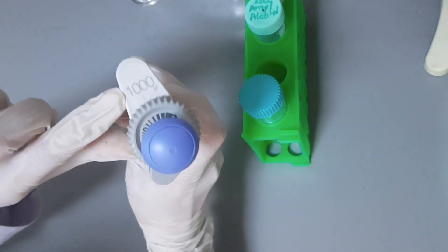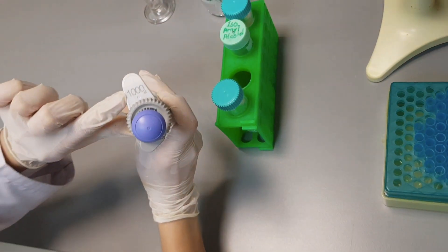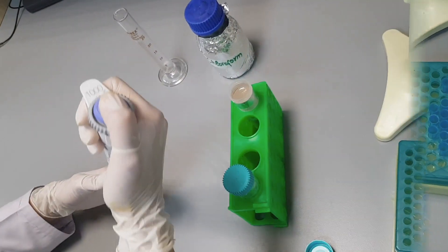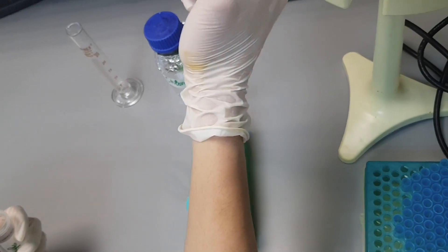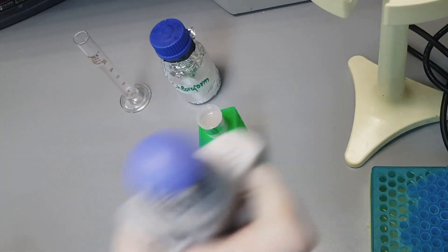Now measure 1 ml isoamyl alcohol by using a 1000 microliter pipet and pour it also in the falcon tube.